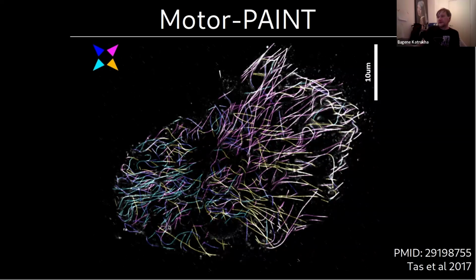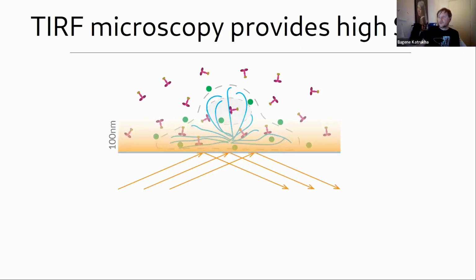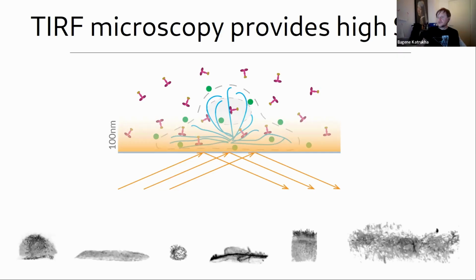There is even a worse attraction to the flatness, because to reliably image individual molecules, usually people employ so-called TIRF microscopy. TIRF microscopy basically illuminates a very thin layer close to the coverslip, around 100 nanometers, which gives you an optical slice much thinner than anything else, much thinner than confocal. Then you remove all the out-of-focus, diffusing molecules, and you have really bright single molecule signals.